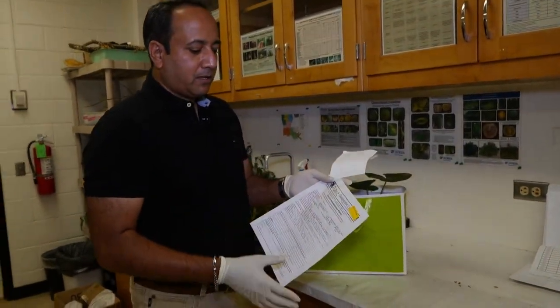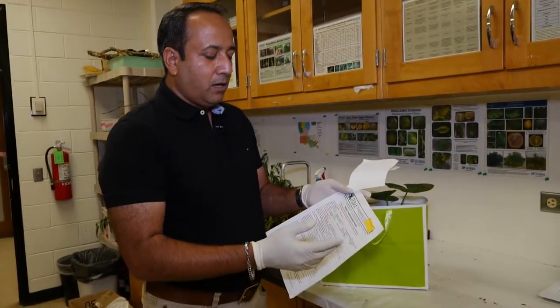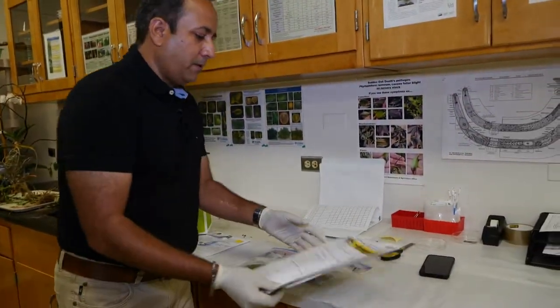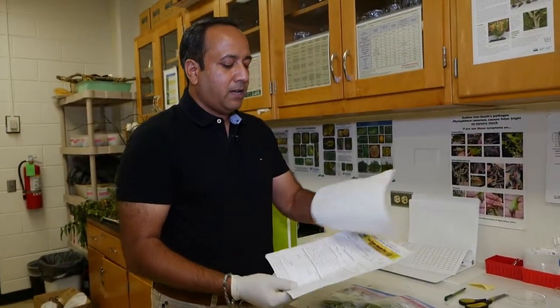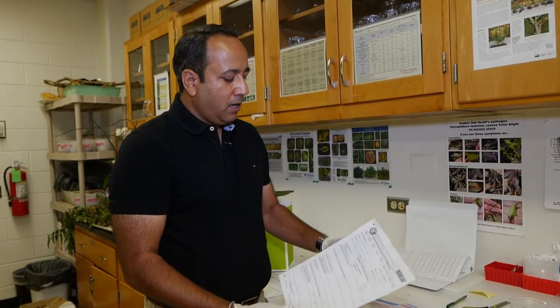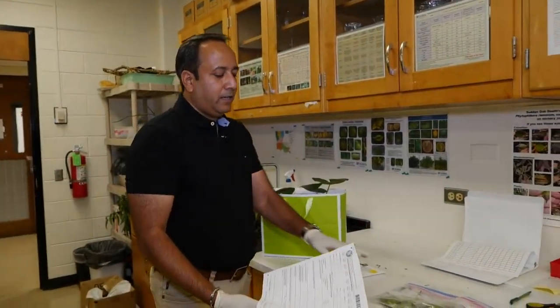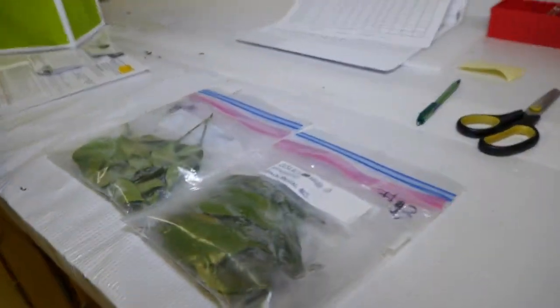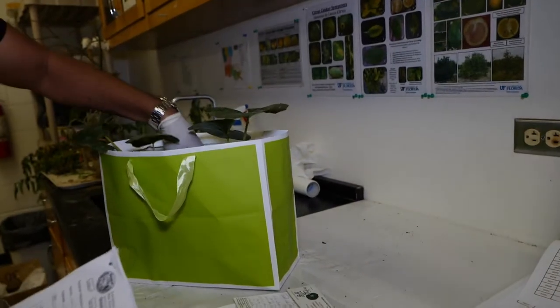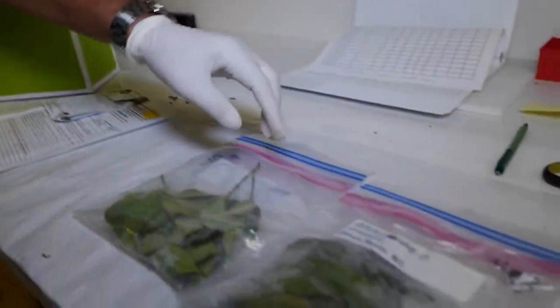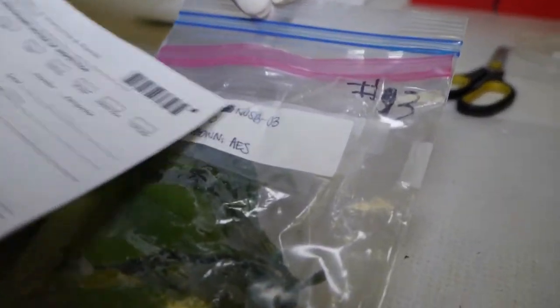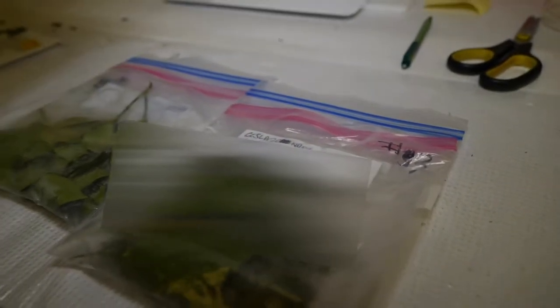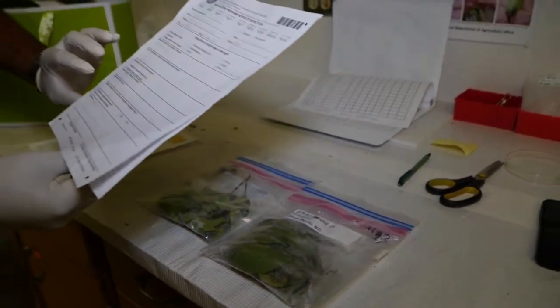Generally at this point of the year, June-July, we are hitting about 500 to 600 samples, but because of COVID-19 shutdown we didn't receive that many. Here is another example of a sample collected by Department of Agriculture and Forestry. This is a regular sample; this is a quarantine sample. You can see the difference—this came in a regular gift bag, but this sample has a collection number and everything, and it's double-bagged.